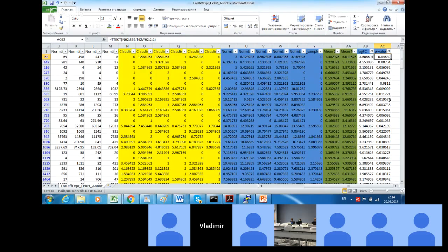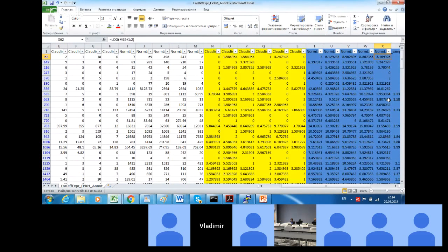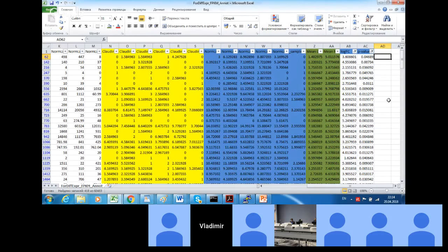In some types of analysis, for example, if we analyze microRNAs, even softer thresholds on fold change are applied sometimes, but these cases are rare. And so, doing so, we have a list of genes that are upregulated. It means that for the second condition, they have statistically significantly higher expression level in comparison with the first condition.